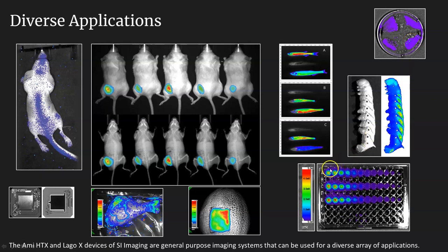We also have many investigators that, before going in vivo, will evaluate their cell line or their nanoparticle construct that expresses bioluminescence or fluorescence light in an in vitro context to make sure that the amount of light being generated is going to be adequate for their purposes when going in vivo. It also provides them the opportunity to evaluate dose levels before going into an in vivo context.